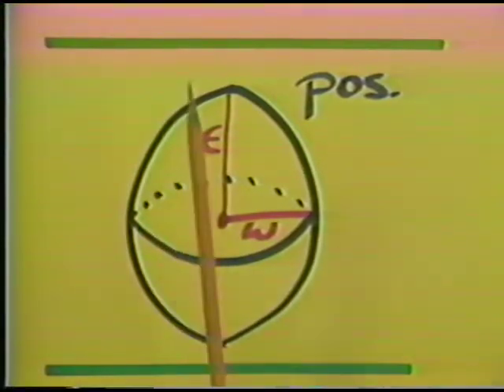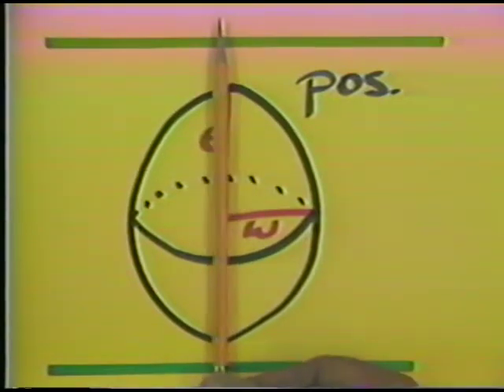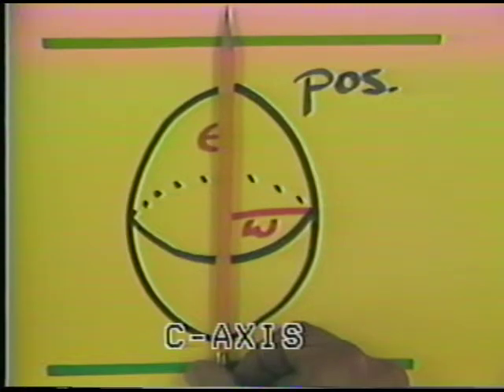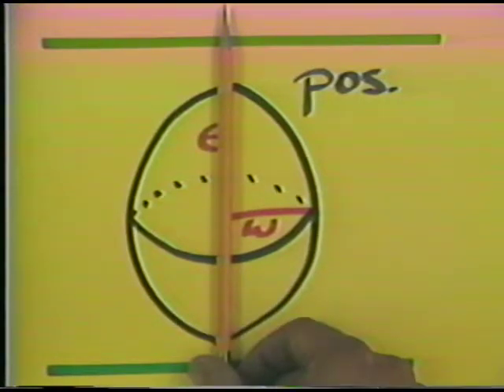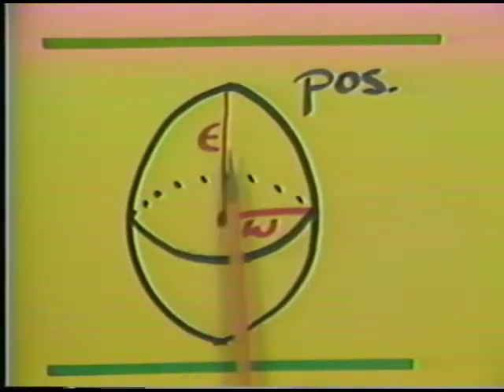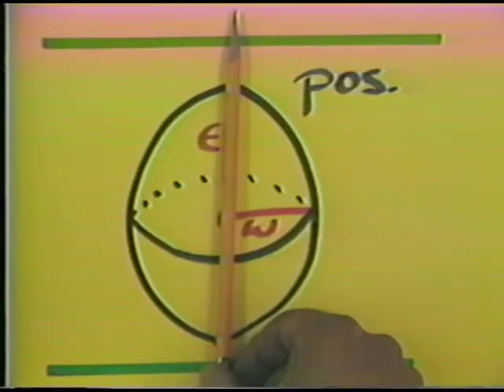Now, the other thing you need to remember for uniaxial minerals is the position of the C-axis. The pencil now shows the position of the C crystallographic axis for tetragonal and hexagonal minerals. These are the minerals that are uniaxial. It's always got this vertical sense of orientation. That is, the extraordinary ray, or the E ray, is parallel to the C axis in these particular minerals.